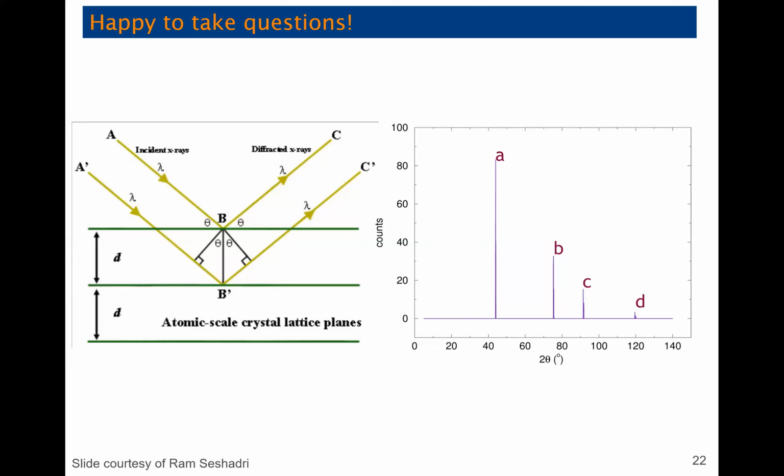And the other thing is the height of the sample, and therefore where the beam is reflecting off of it, can also lead to some differences during the data analysis. Some things change. So you would need to make sure that the surface of your pellet that you want the X-rays to reflect off of is at the same height as the normal sample stage. So there's a way to do it. You just have to be aware of which things are different, and I think that would mostly be sample height and preferred orientation. But yeah, I think there are definitely some scenarios where you would want to keep it in a pellet.